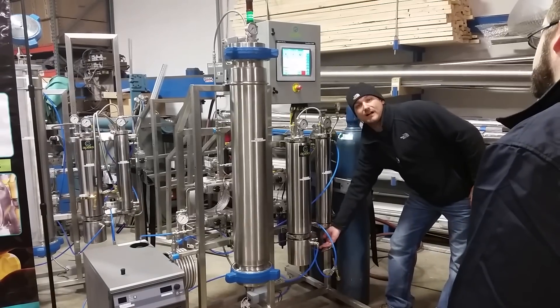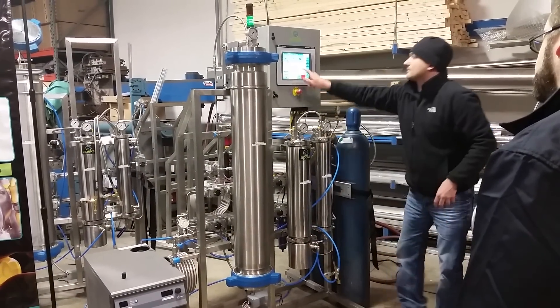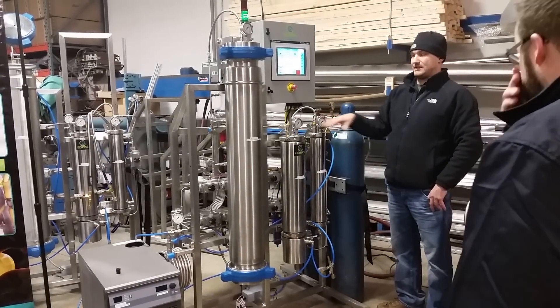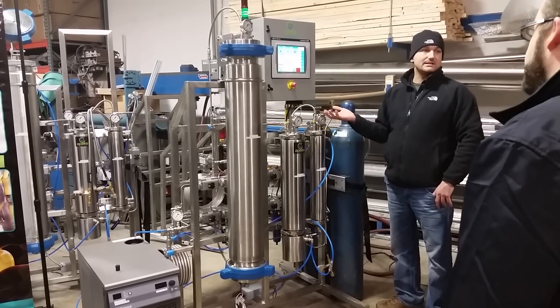Then the only back manual valve in the system — it reminds you to close it. Then you would open your CO2 bottle. When you acknowledge, the system takes over. At that point, as long as everything's good, you walk away and come back in 10 hours or however long your run time is.